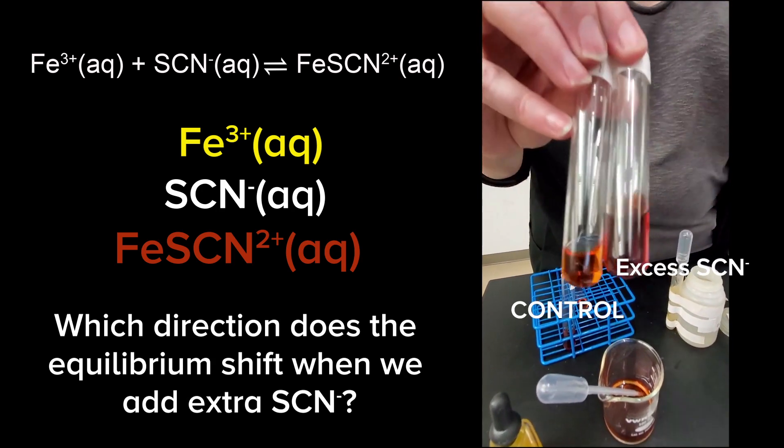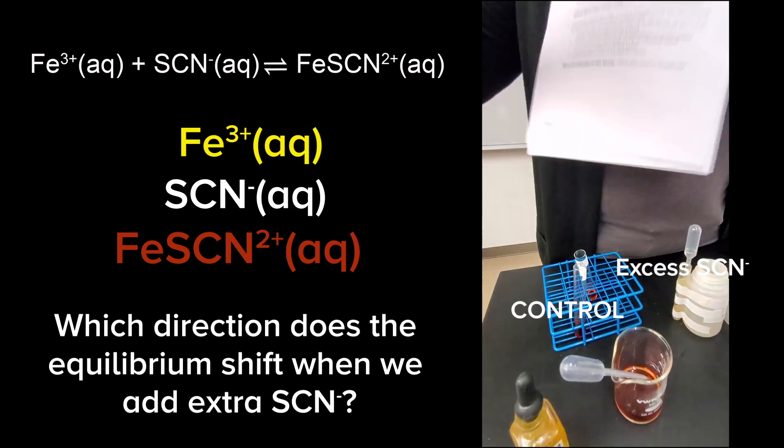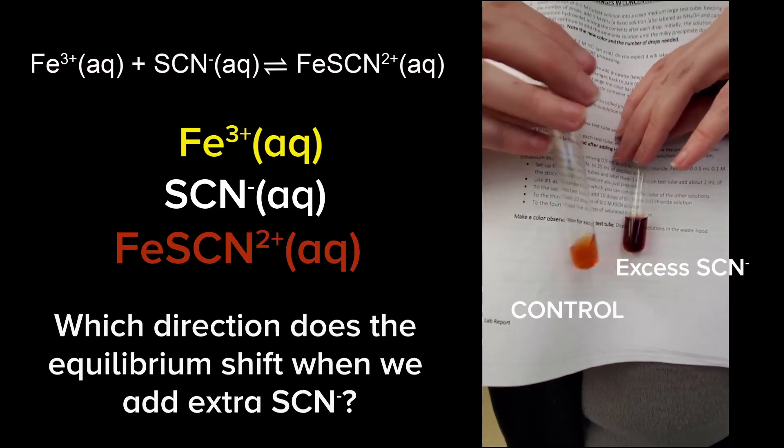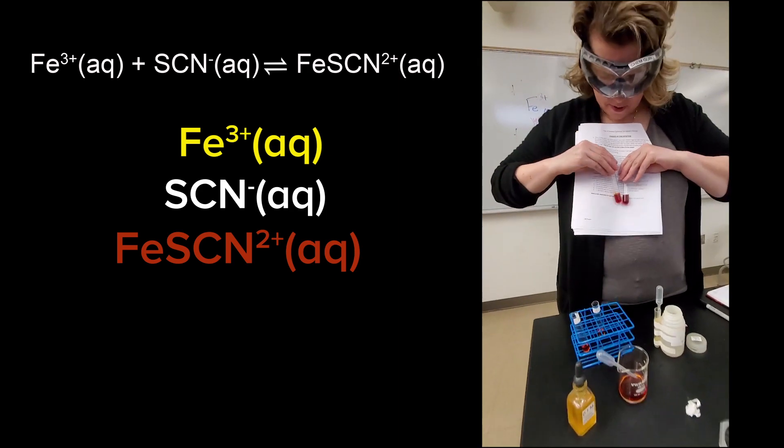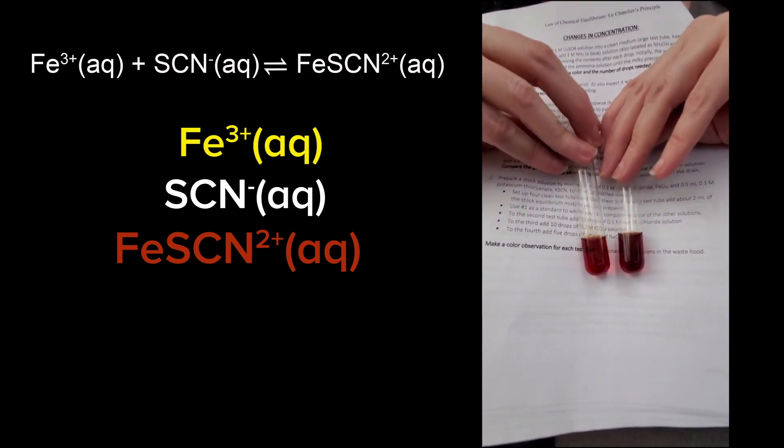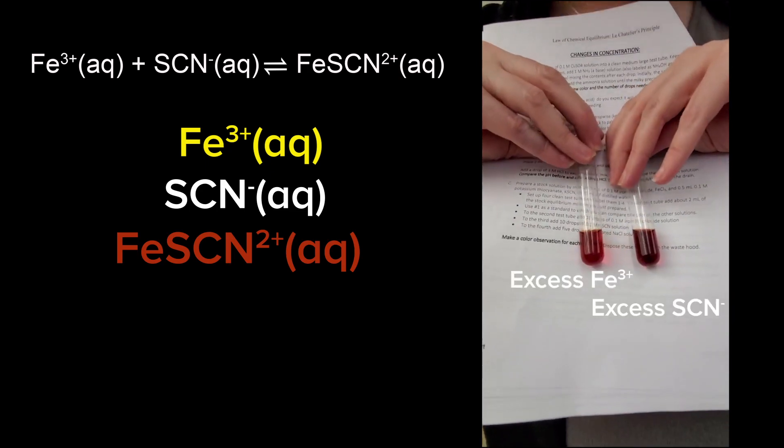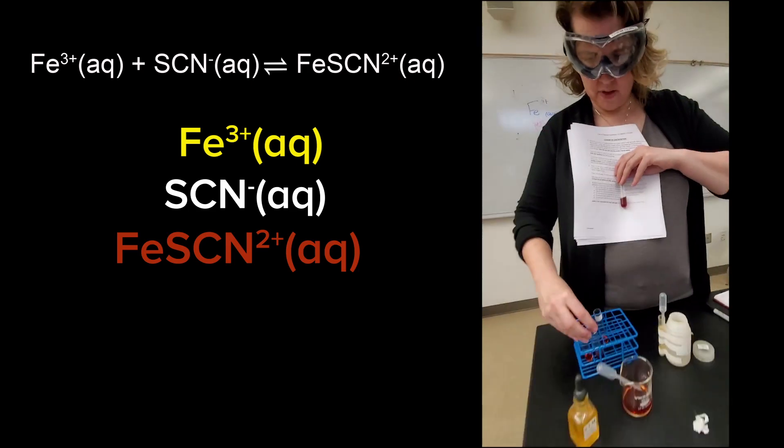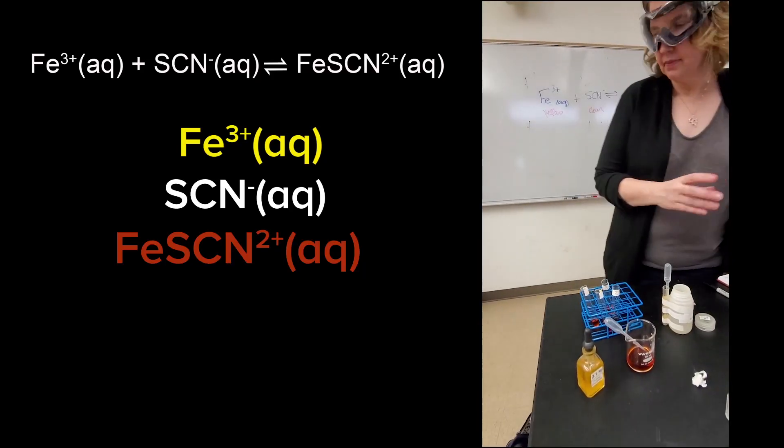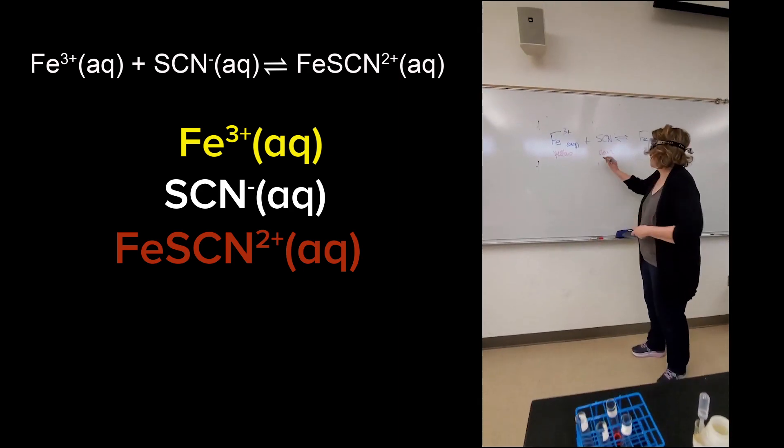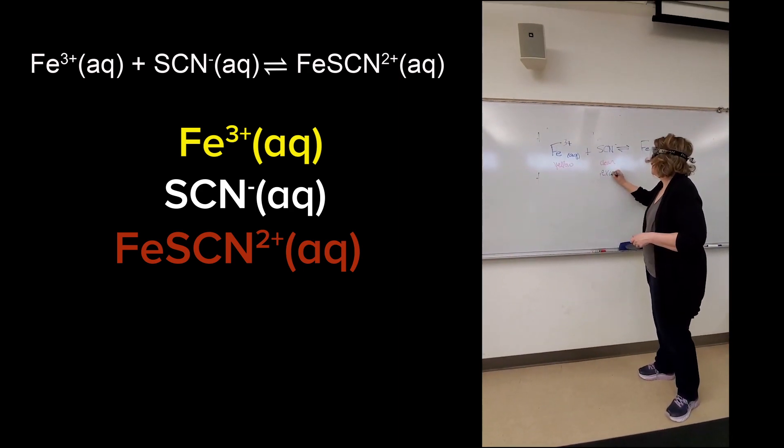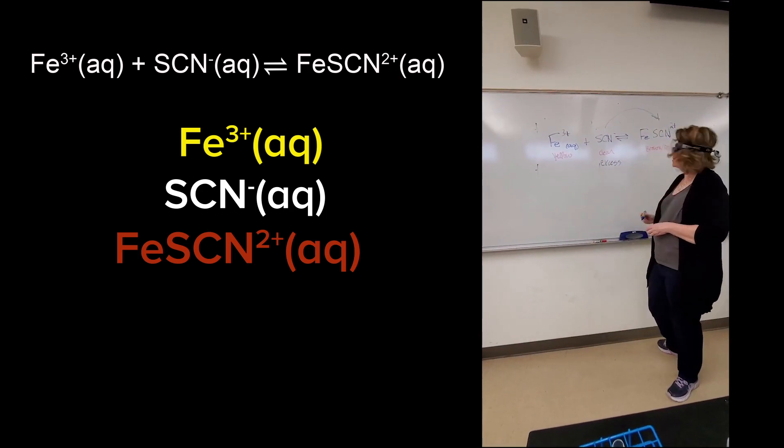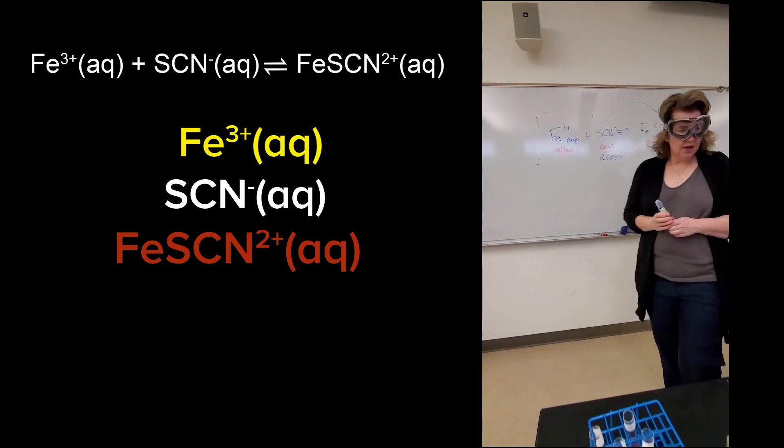Okay. So here's my control again. Let me put it against the white background. So adding the extra thiocyanate. Also quite dark. Also quite dark. Now, if I could compare what happened when I added the extra iron versus the extra thiocyanate, it doesn't really seem to matter which one I added excess of. Either one will do. It doesn't matter. So let's put that up on the board. So again, I put excess thiocyanate so the equilibrium again shifted to the right to give me extra brown red color.